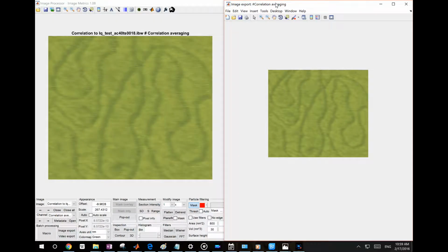It's also useful if you have, like in this case, images in solution. In my experience, you might observe dynamics of this DNA molecule in solution. So when you average these, if you have dynamics, the DNA won't average well, and you would observe it moves. So the signal could be diffused, and you will observe those dynamics as a function of how diffusive your DNA is in the average image.